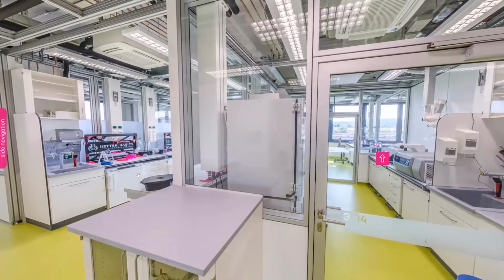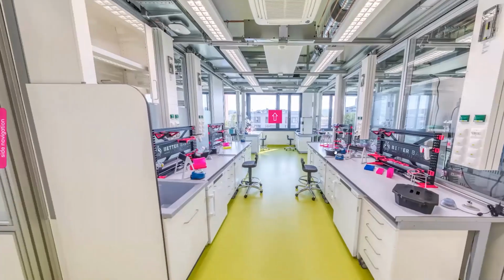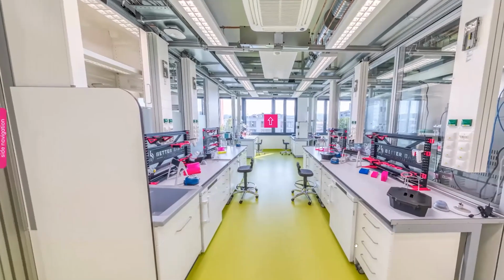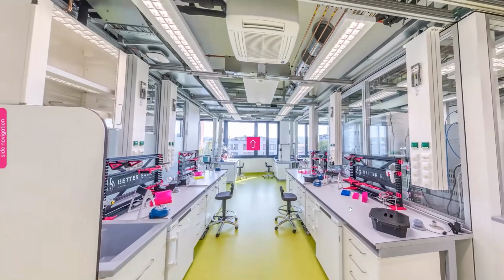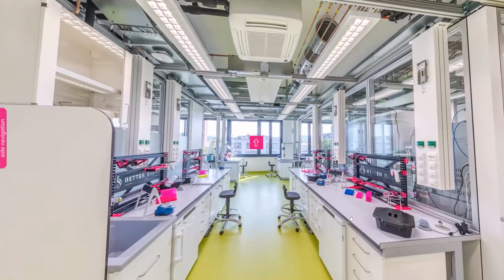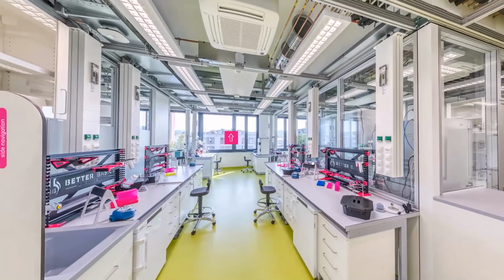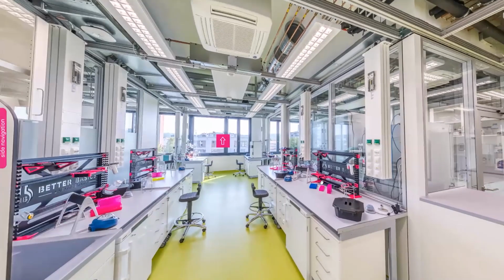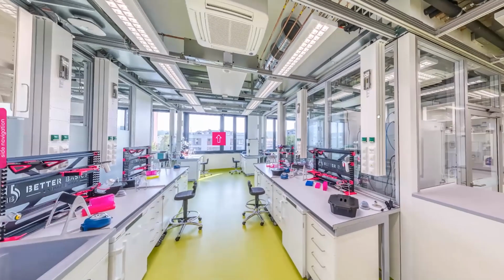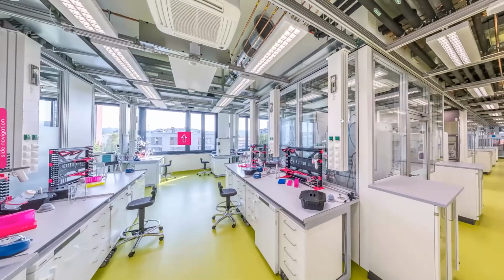And now just have a closer look at one of the benches. So if you rent a bench, this is basically what you get: one bench in the open space lab, a bit of a storage facility, it belongs to that little fridge, a rack to help you organize a set of pipettes and everything that is supplied through those media columns, Torsten, that you were mentioning. And maybe you want to elaborate a bit on that.